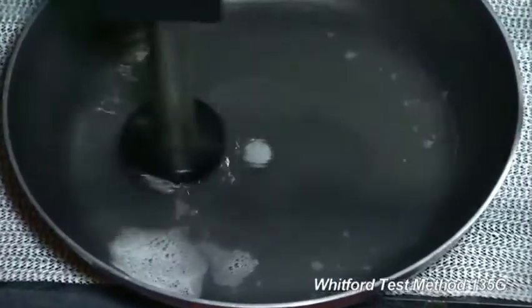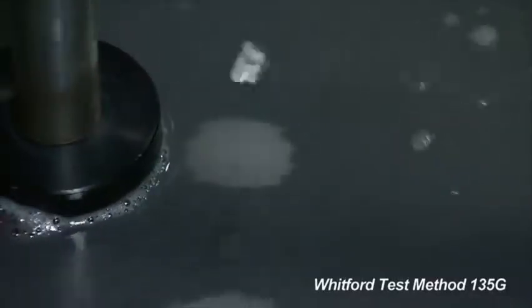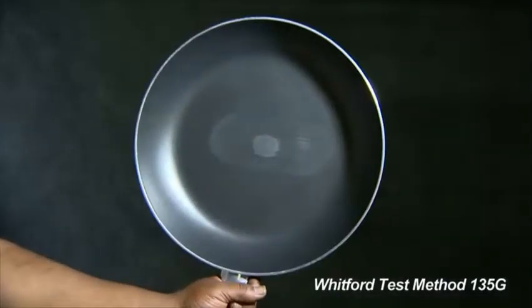Continue running the test and monitor the strokes until 10% of the substrate shows through the wear area, at which point the test is over. Record the number of cycles.